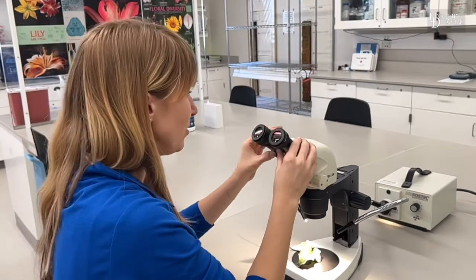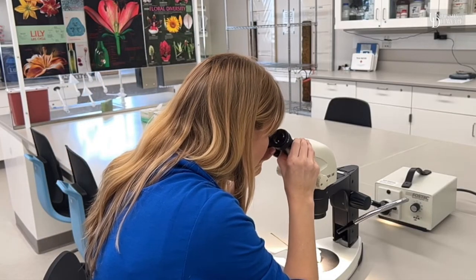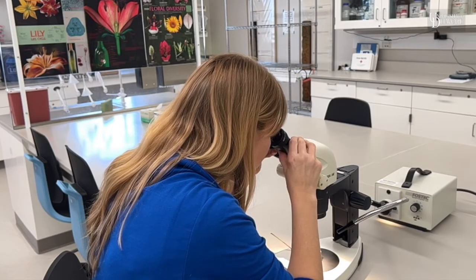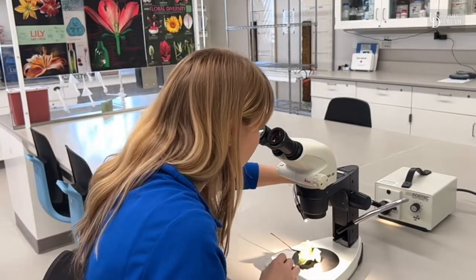The next thing you want to do is move the lenses in and out to fit your eyes. You move them until you see one image — if they're too far apart, you may see two images. So just adjust them until they look right to you, and you may have to adjust your focus while doing this.